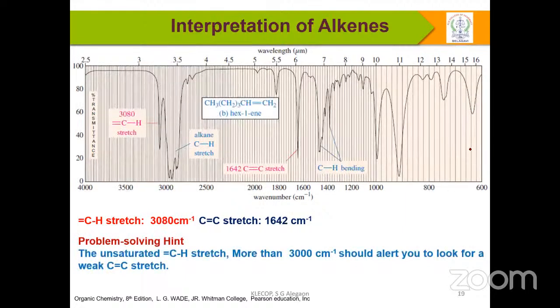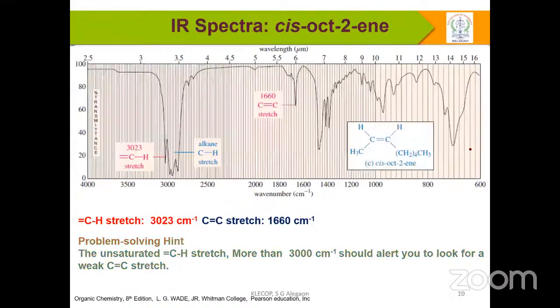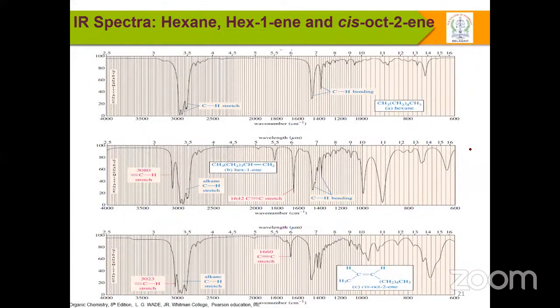Can you see the carbon-carbon double bond? We are not going to assign cis and trans here, and we observe a very strong peak. Whereas in exactly the cis system, the carbon-carbon stretch becomes weak as compared to the previously strong character.